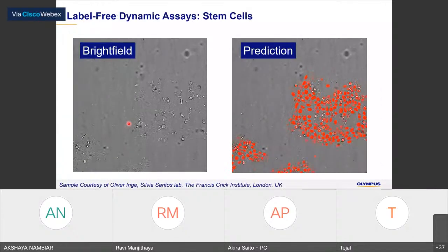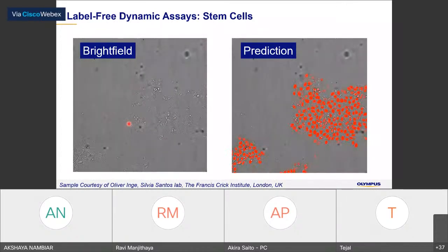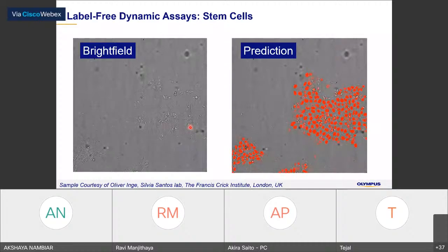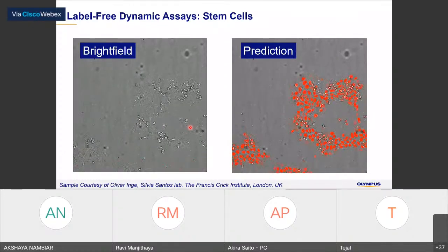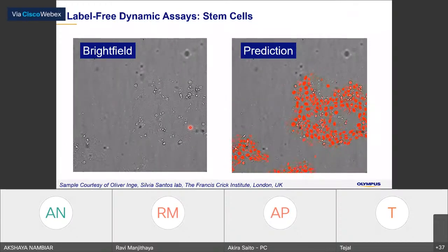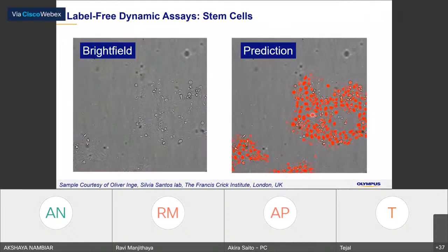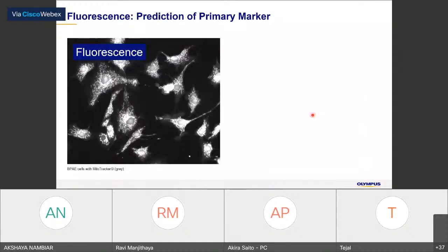And of course, we can use this kind of segmentation analysis for time-lapse imaging, and you can find that this is a stem cell, so the contrast of the background is a bit higher than the regular 2D cell culture. But I can see that it counted the nucleus very well.